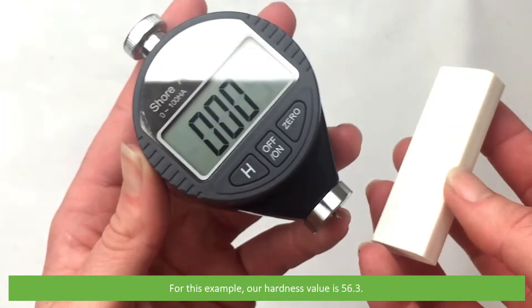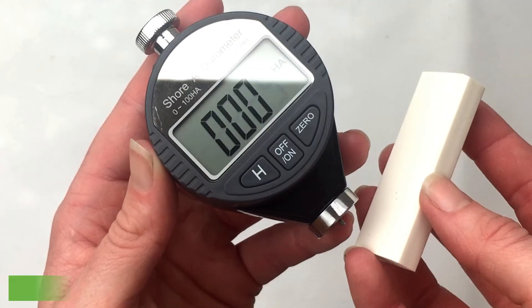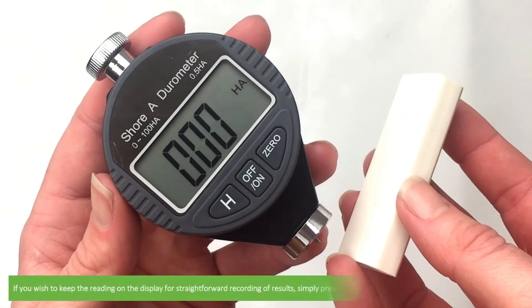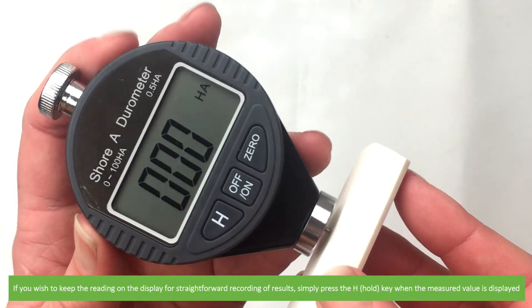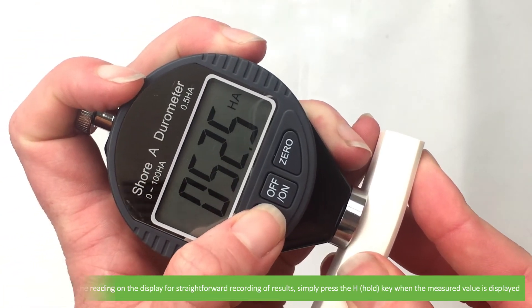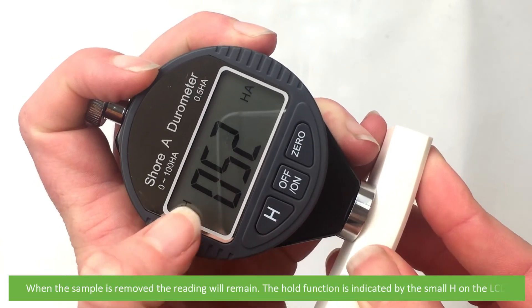For this example, our hardness value is 56.3. As you can see, the measured value disappears from the screen once pressure is released. If you wish to keep the reading on the display for straightforward recording of results, simply press the hold key when the measured value is displayed. When the sample is removed, the reading will remain.